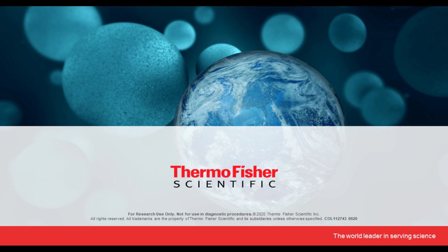Great, thank you. Now, how do you go about a no-stain normalization if the transfer has not been even throughout the whole membrane? The question really is that, for some reason, what you loaded on your gels is not evenly transferred onto the membrane, which would indicate that there is a problem with the transfer method or the transfer efficiency, because typically what you load on your gel should be reflected on your membrane as well. So that uniformity should be there in your transfer method.